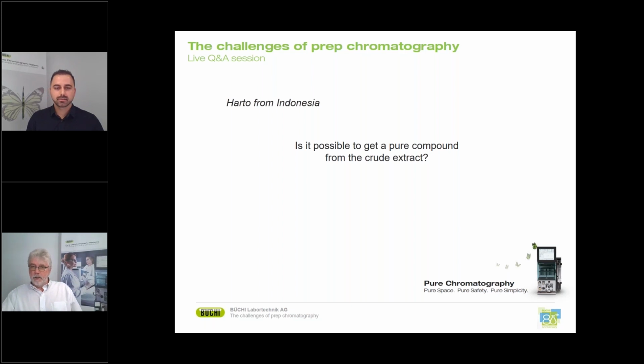Is there a standardized protocol for purifying bioactives from plants, like tannins, flavonoids and phenols, and so on?